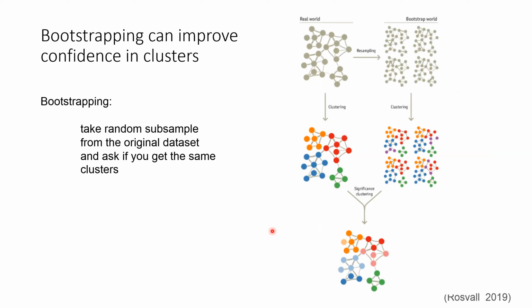Yes, instead of absolute abundance, some people do use z-scores of abundance to normalize over all the genes, regardless of the abundance, to weigh them equally. And I had a discussion about this once that I'm blanking on right now, but if you remind me, Harry, I can get back to you.